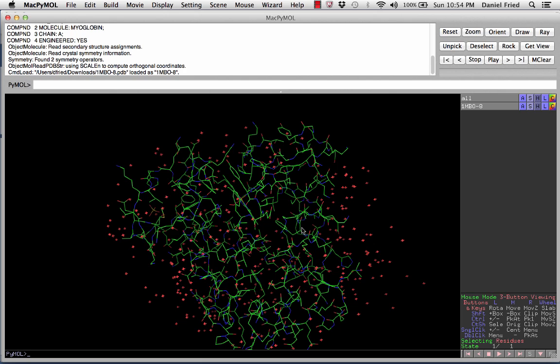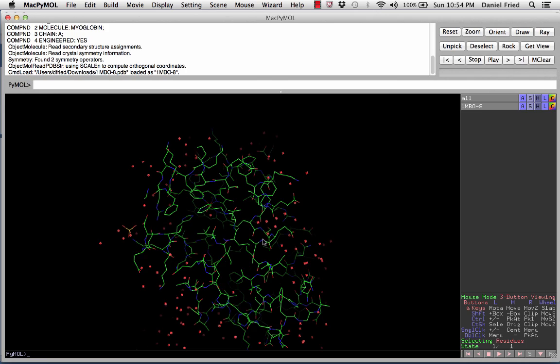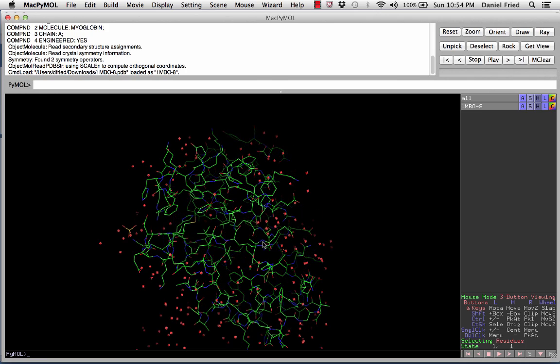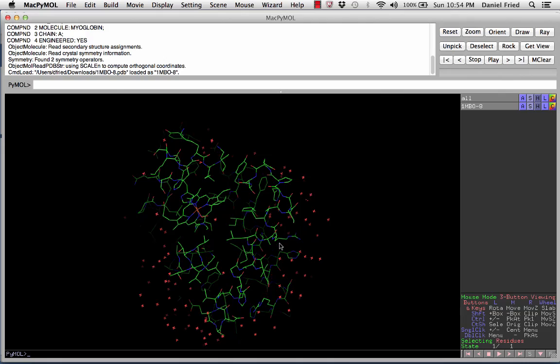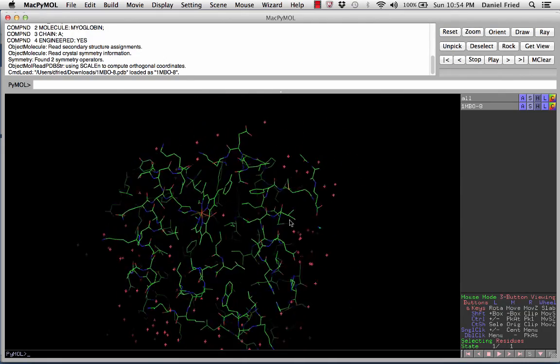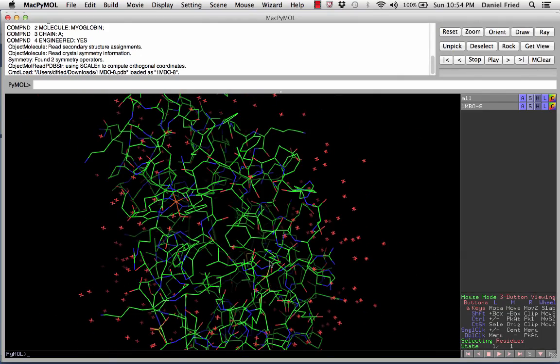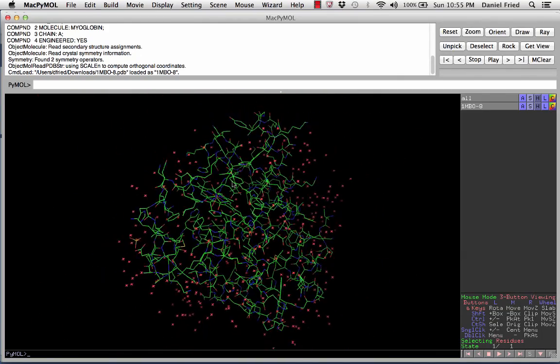Another important function of the mouse is to change our angle of view. So now use the mouse scroll key to actually scroll. You can see some things that are disappearing now. This allows us to change the angle of view and eliminate certain information. This can help us if we want to highlight certain parts of the molecule by eliminating something in the foreground or in the background.